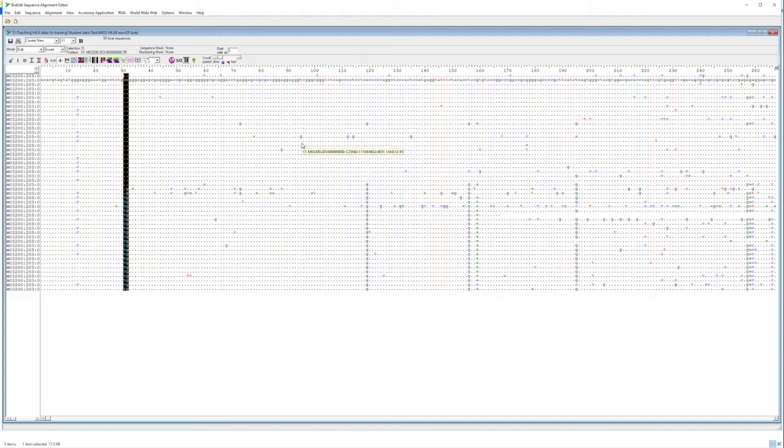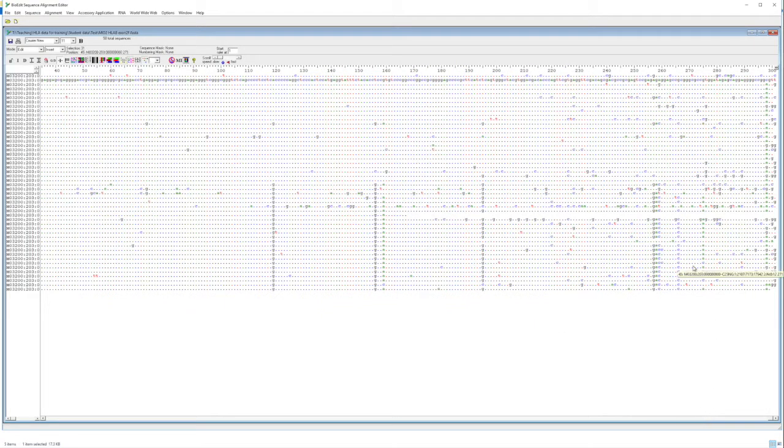So now what might become evident with a closer look, this is obviously the first difference between the two alleles, the CC versus the TG. And if we scroll right over to the other side of the page, we'll see that the last differences between the two alleles are this GACCA.